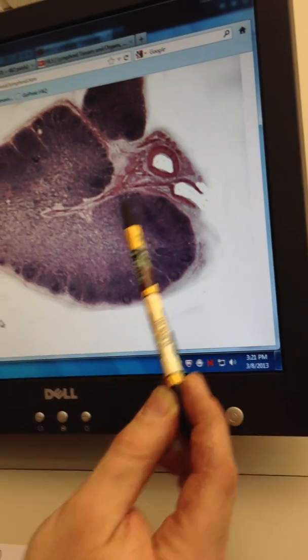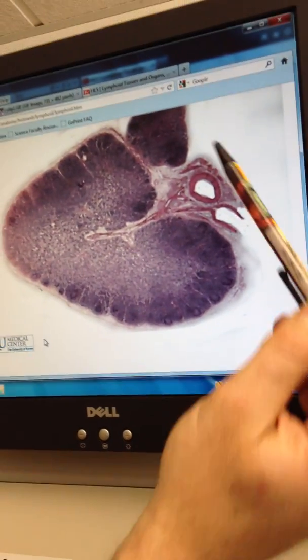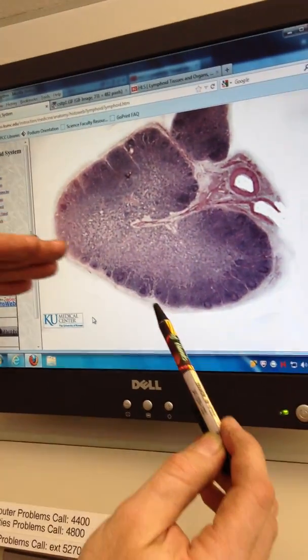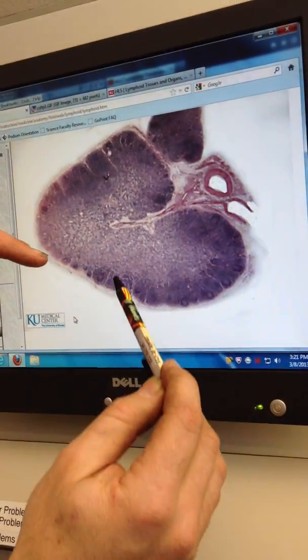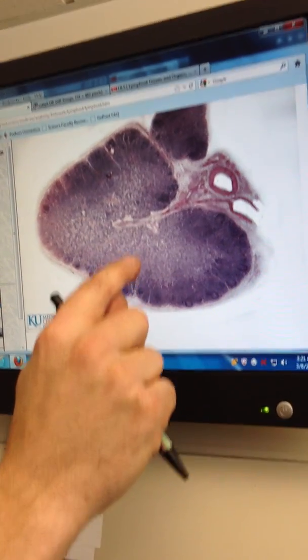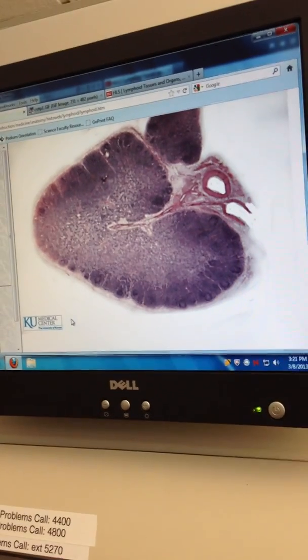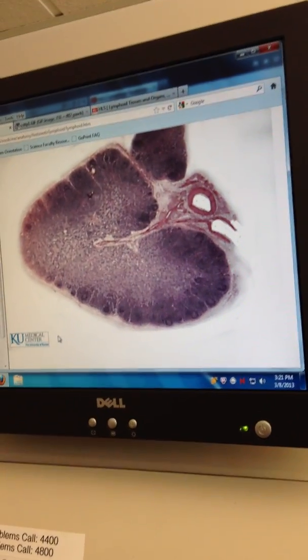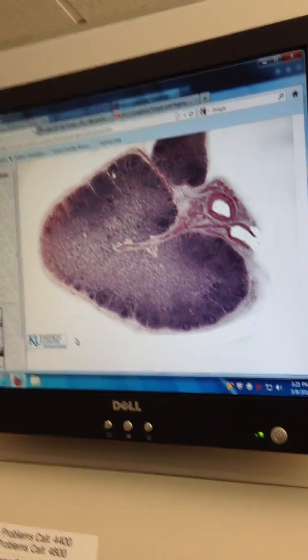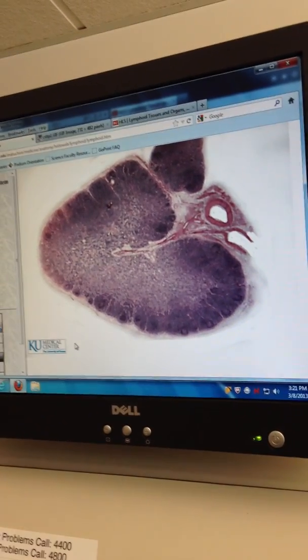And the lymph goes in. Lymph would basically, you can't see it, but somewhere there'd be a lymph vessel coming in, kind of dumping it. It kind of oozes its way from the outside and then drains in, into the trabeculae, and then trabeculae to here, cords, to here, the sinus, and then it goes away clean to the hilum, or hilus. Like a little filter. So all your lymph tissue organs would have those parts.